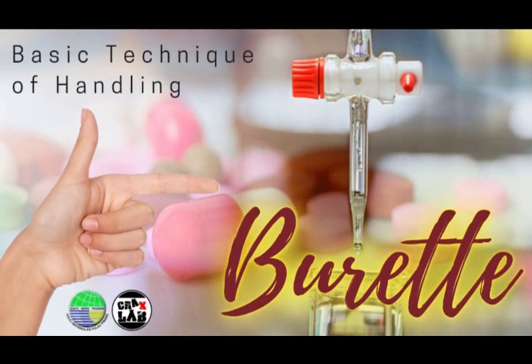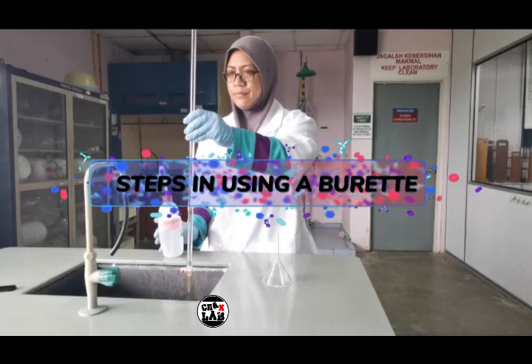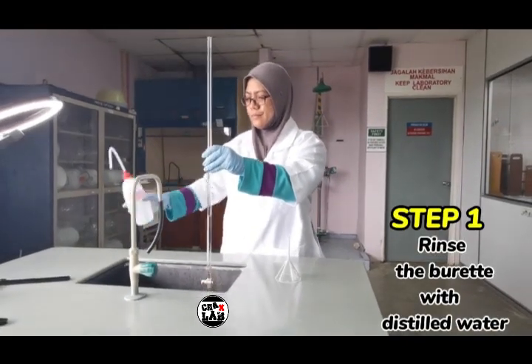Basic technique of handling a burette. Steps in using a burette. Step 1. Rinse the burette with distilled water.